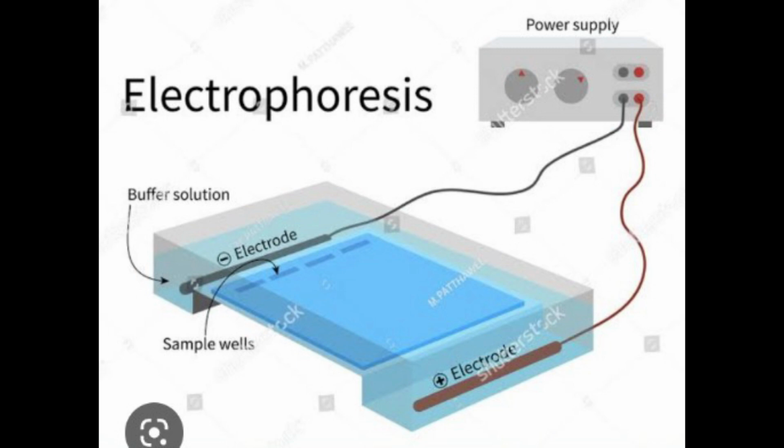Add enough staining solution to cover the gel. Stain for an hour or until adequately stained. Remove the staining solution and replace it with 100 ml of wash solution. Swirl the wash over the gel by rocking the container for several minutes to hours, until excess stain is removed and unstained areas are completely clear.